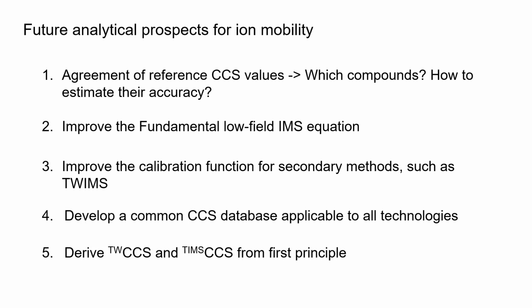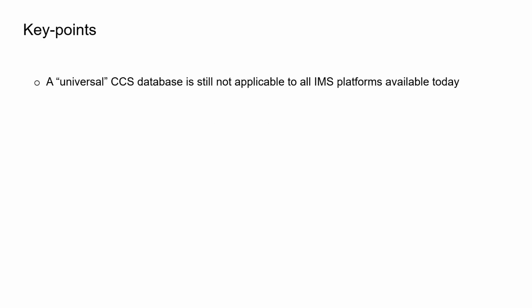Then something amazing would be the possibility to derive the traveling wave CCS and the trapped ion mobility CCS from first principles through a physical formula like the Mason-Schamp equation. But this could be just an exercise in style for physicists and mathematicians if we are able to reach highly precise and accurate CCS values from an optimized calibration function. And finally, I want to conclude this video summarizing the key points that I have touched on in this presentation.